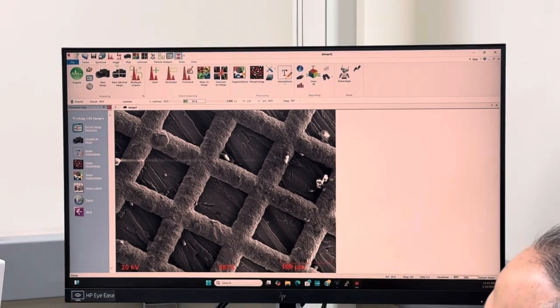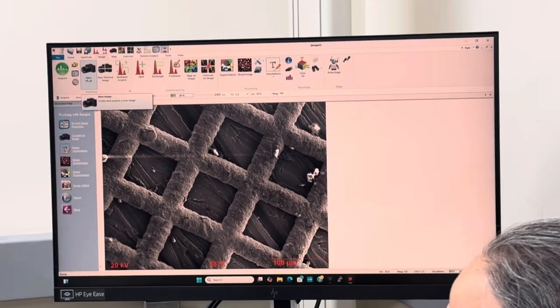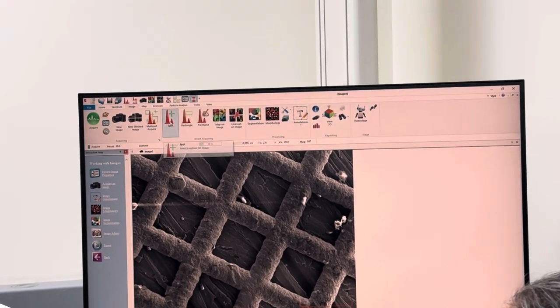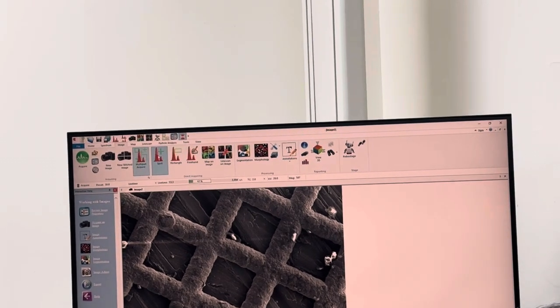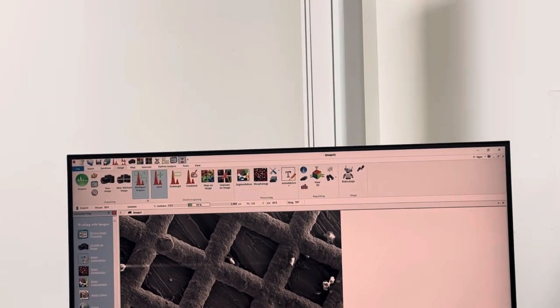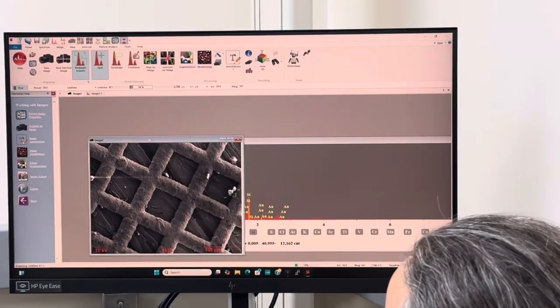Now, the image tab gives us some more features than the flow chart. So the image tab, as we acquire a new image, and all of a sudden we see this multi-point acquisition, we have a spot, we have a rectangle, we have a freehand. So if I click on a spot, and I drag my mouse on the screen, it becomes a spot crosshair. So if I come over here and I say, what's that made out of? Let me shrink this window down so I can move my image window over.